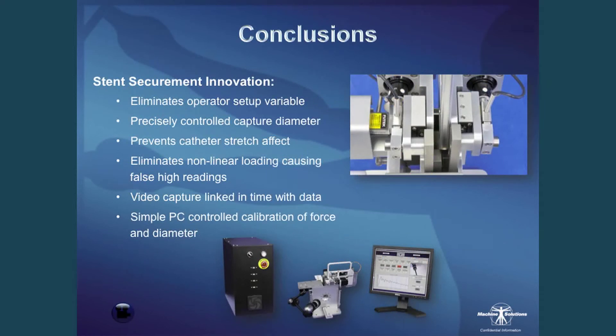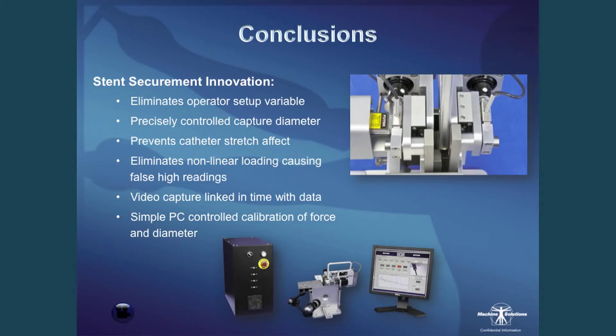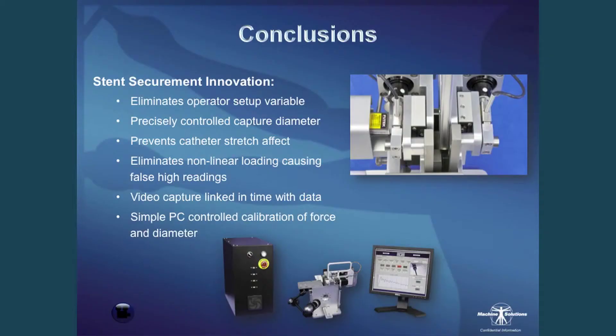Features MSI built into the SR1000 to eliminate variation: diameter control and force control eliminate operator setup variability. The two sets of segmental heads keep the two heads concentric — when you close down on your grip and capture, the sample is always linear with no side axial loading to add variability. A very short gauge length prevents stretch effect of the catheter — pulling a polymer with any stretch leads to variation. The PC-controlled system handles all force and diameter calibrations within the system, eliminating a lot of operator variability.